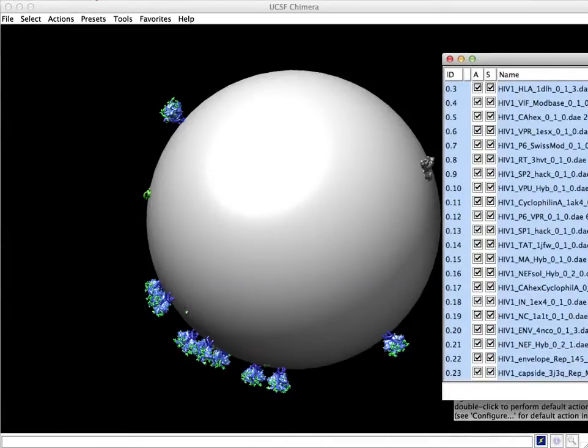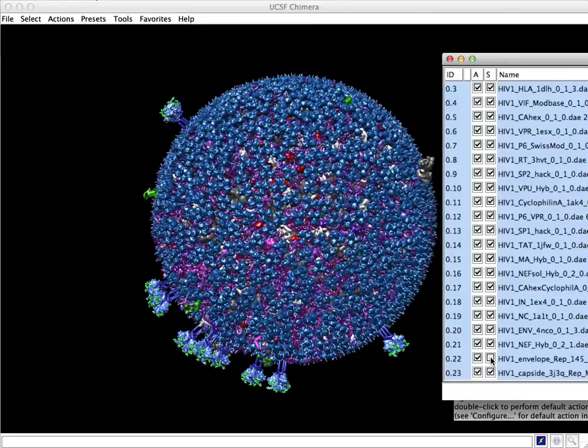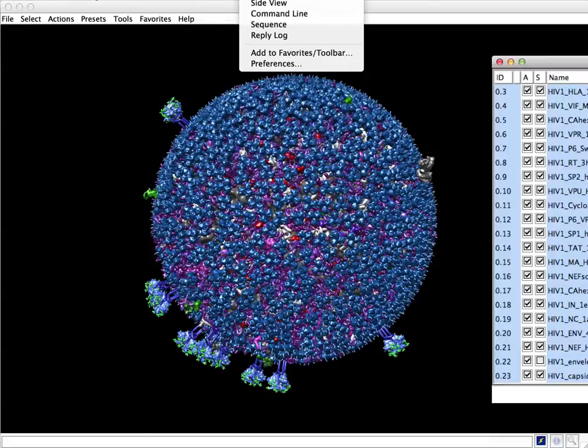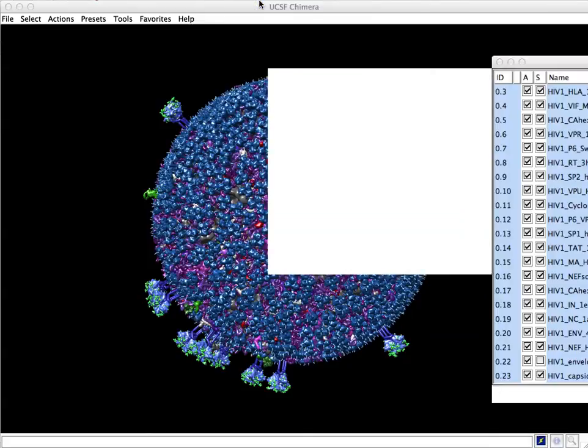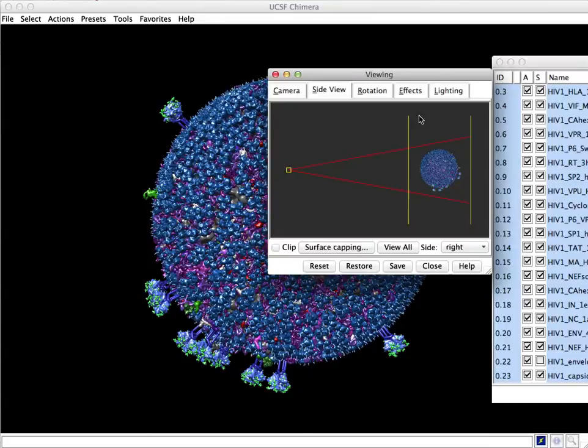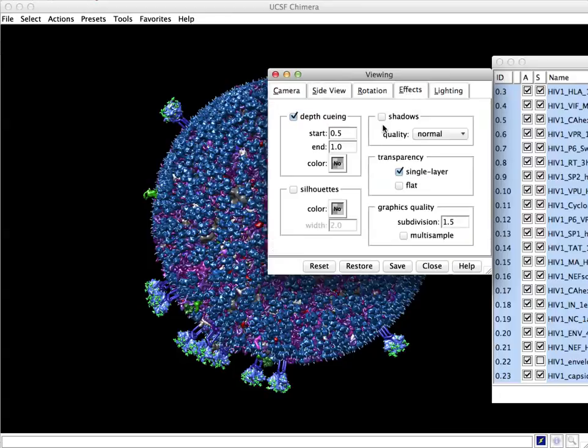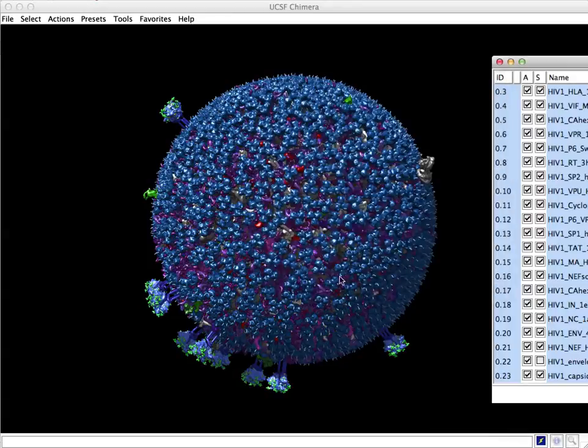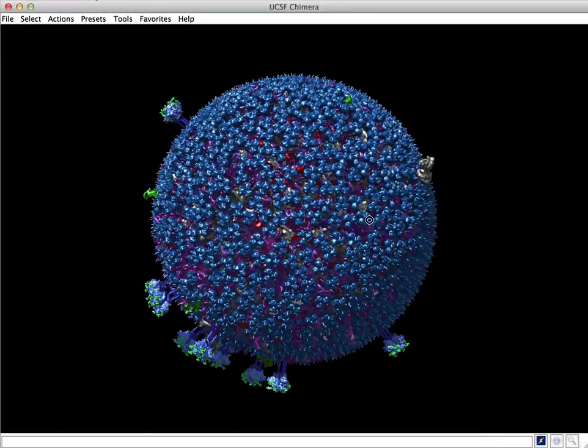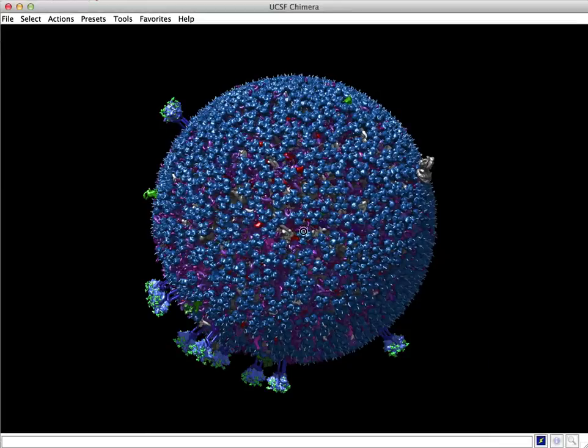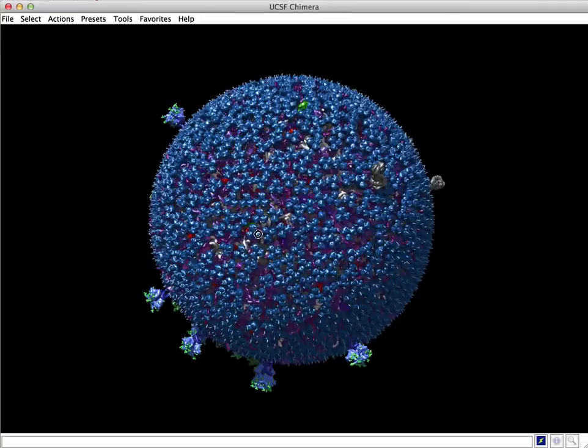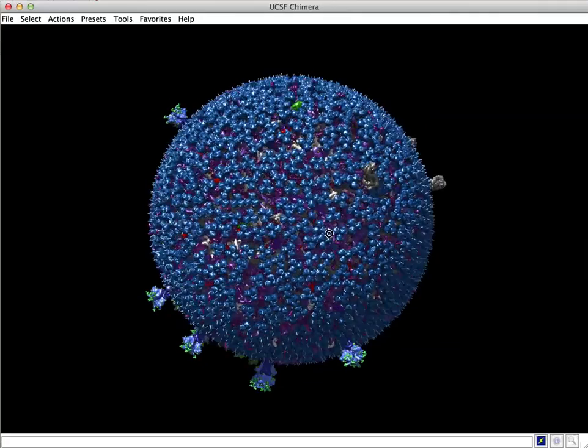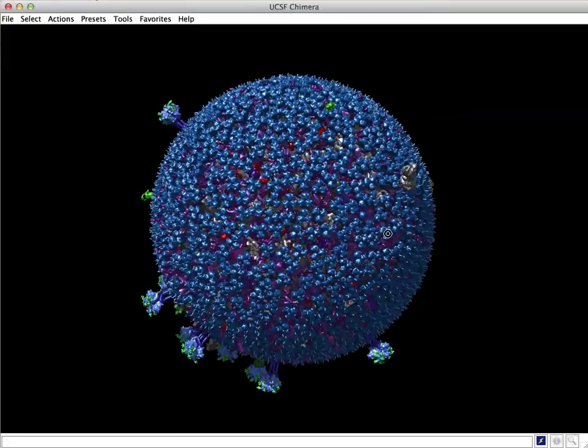And from there, you can do stuff like turn off the visibility of one object. And it's helpful with a large model like this that if you turn on shadow casting, for example, which really helps you better understand the dimensional relationships of the objects to each other.